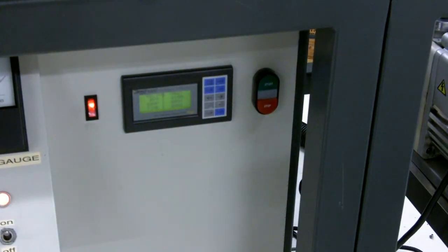Next we are going to demonstrate the spinner which is installed into the vacuum atmospheres glove box. Pictured here is the controller for that — it's programmable, set to time and RPMs. On the right of that is the start/stop button, which can be used optionally. There is a foot pedal attached to the unit which can be used to start the process.